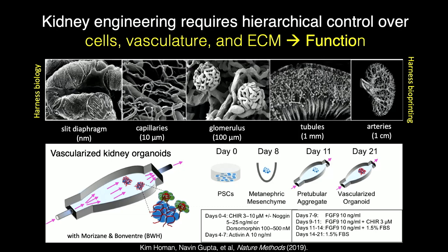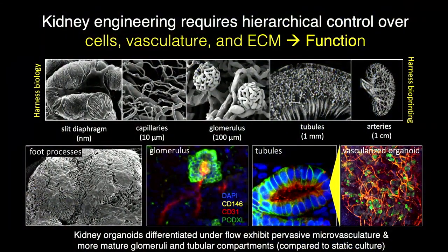And this has been a limitation of the organoid field for those of you who are familiar with that. Being able to generate vascularized organoids through the protocols that have been published to date simply has not been possible. So we have, in fact, been able to demonstrate a path forward where we can vascularize these organoids, both by introducing flow across them as they're continuing their differentiation, and also by embedding them onto an adherent extracellular matrix, which we've designed.